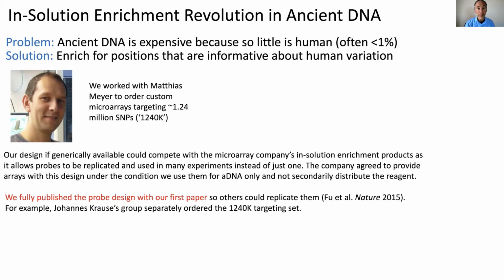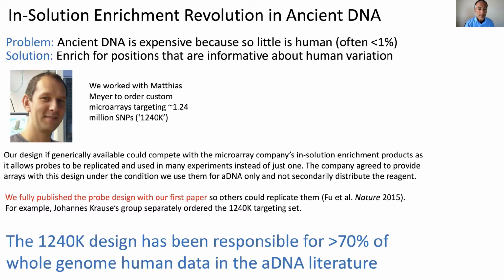We fully published the probe design with our first paper so others could replicate it, and indeed some groups have. For example, Johannes's group at the Max Planck Institute for the Science of Human History in Jena, Germany, separately ordered this targeting set. This design that we developed has been responsible for more than 70% of the whole genome human DNA in the ancient DNA literature.